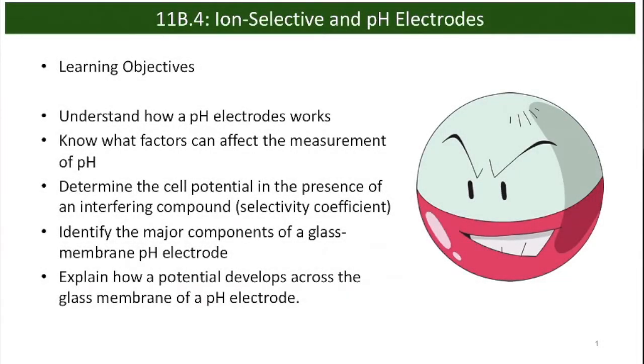In this video, I'm going to talk about ion selective electrodes and how they work, as well as pH electrodes, which are a type of ion selective electrode, and some of the limitations of making measurements with a pH electrode.